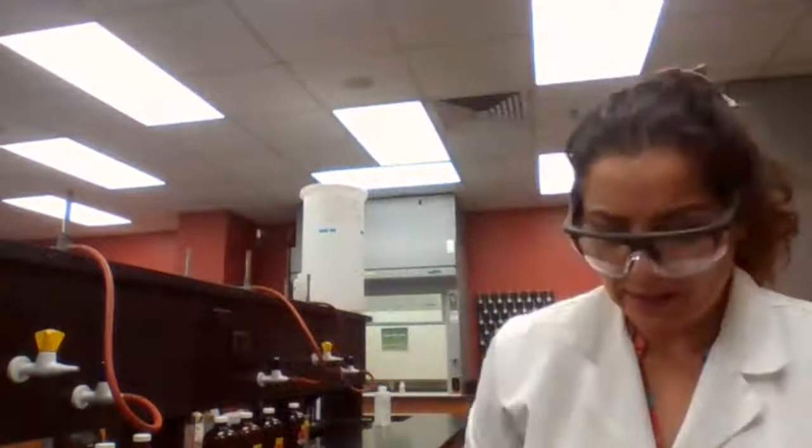We are going to compare ionic compounds and covalently bonded compounds. One of the differences between them is conductivity. For a substance to be a conductor of electricity, first of all, it must be ionic, and second, the ions must be mobile.